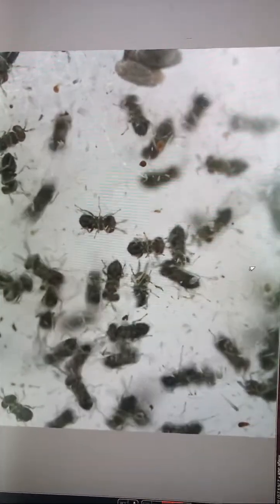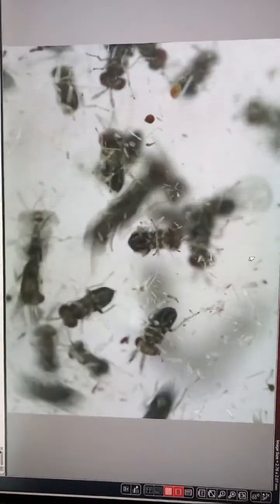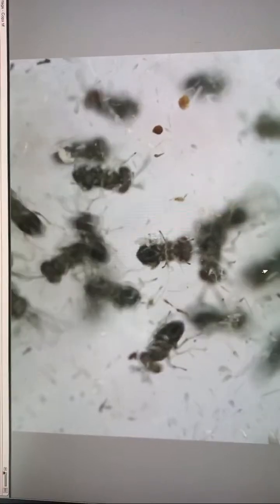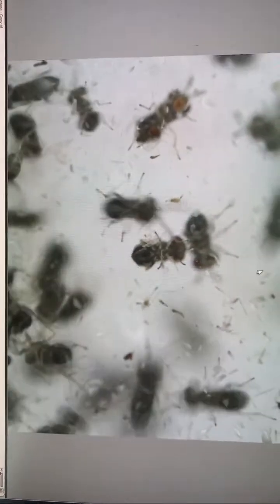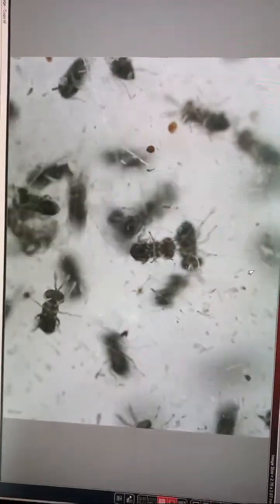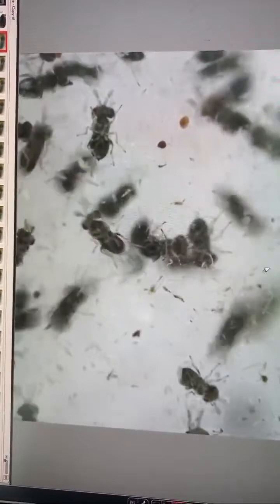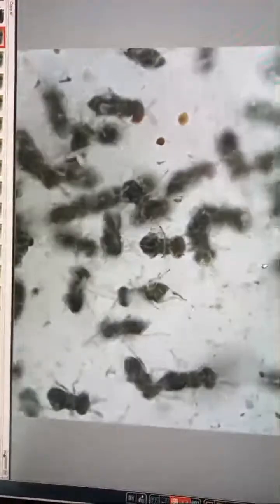I can increase magnification at least maybe 2 times. You can try to take a better focus, but it's quite difficult because most of these tiny insects were crawling and moving very quickly. There are some males and females. We have precise differences, quite easy to recognize them, but only under the microscope, because original size is just 0.5 millimeter. You cannot understand male or female. Here, if you are careful, you can recognize some individuals with very short antennae, with club, and very long antennae, with seta, long antennae belonging to males and short antennae to females.